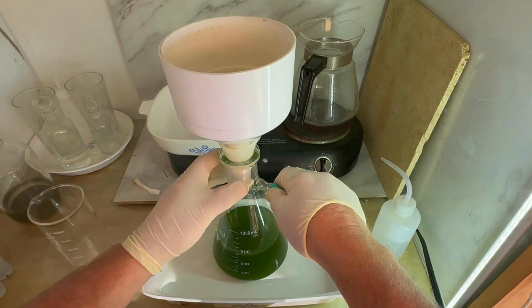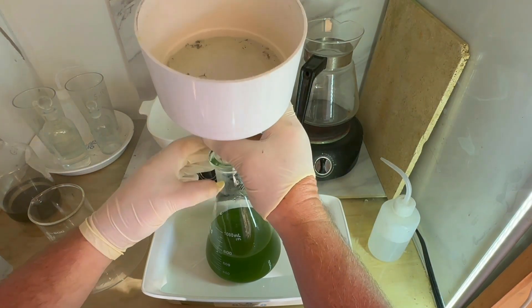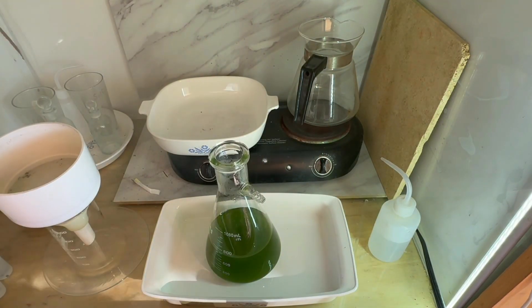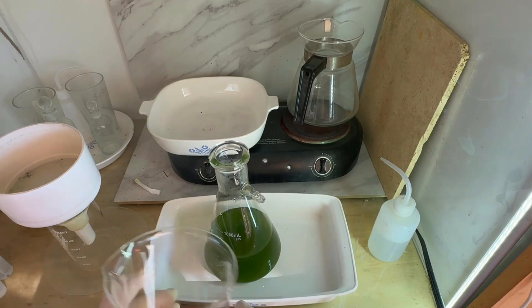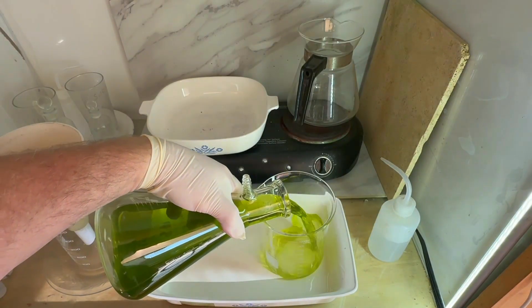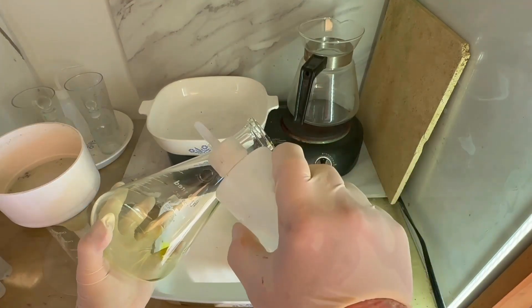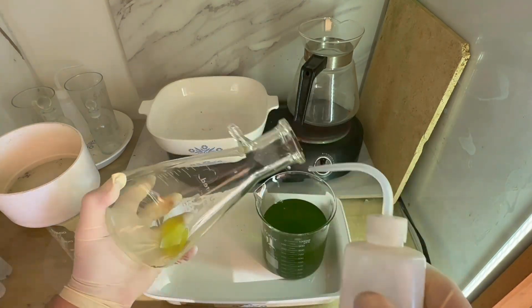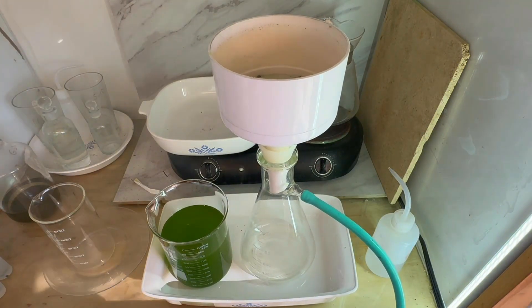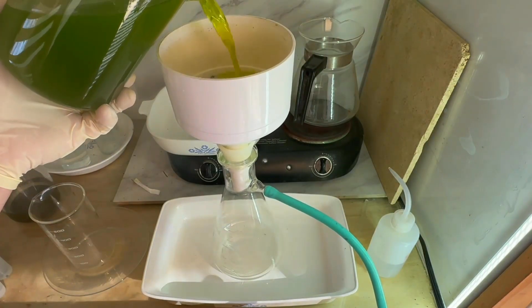We've finished the first filtration. You can see all that silver chloride and some plastic-looking stuff in our filter. I'm going to empty the flask into the beaker — there's quite a bit of cloudiness still in there, so we're going to run it through that same filter again. All the other junk in the filter is going to clog it up some, so I fully expect this to be a very slow filtration and I'm probably going to put it on super time-lapse mode.